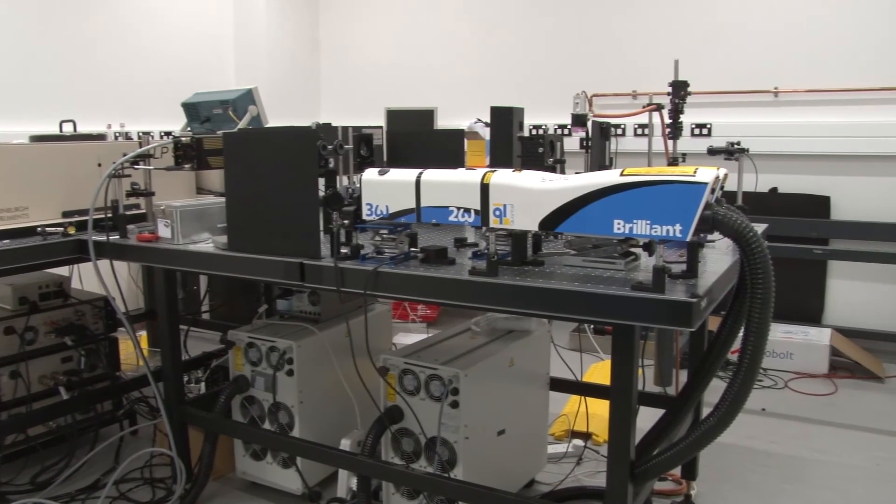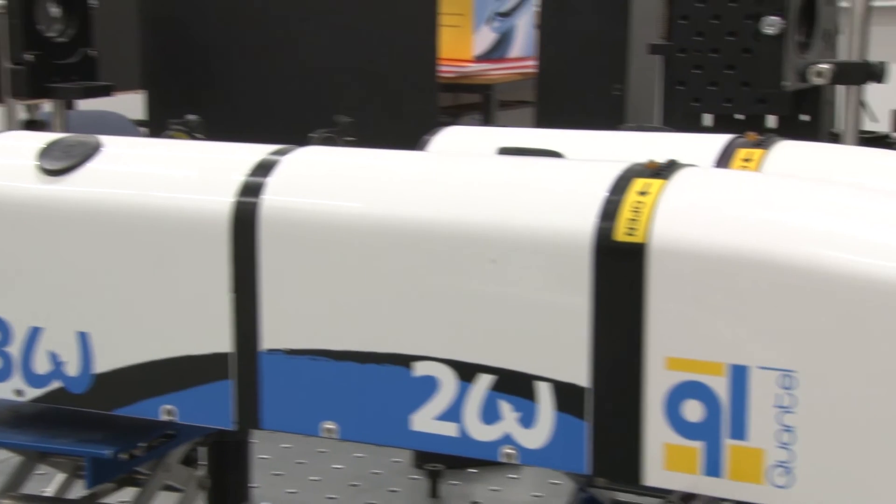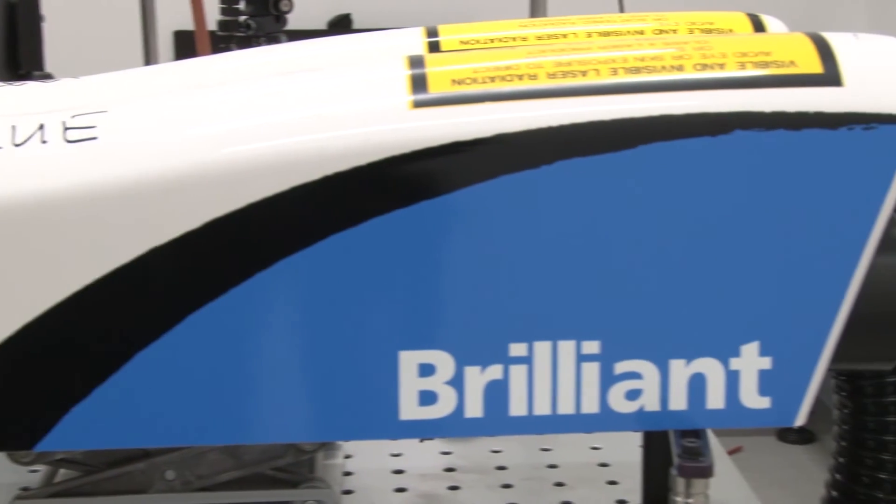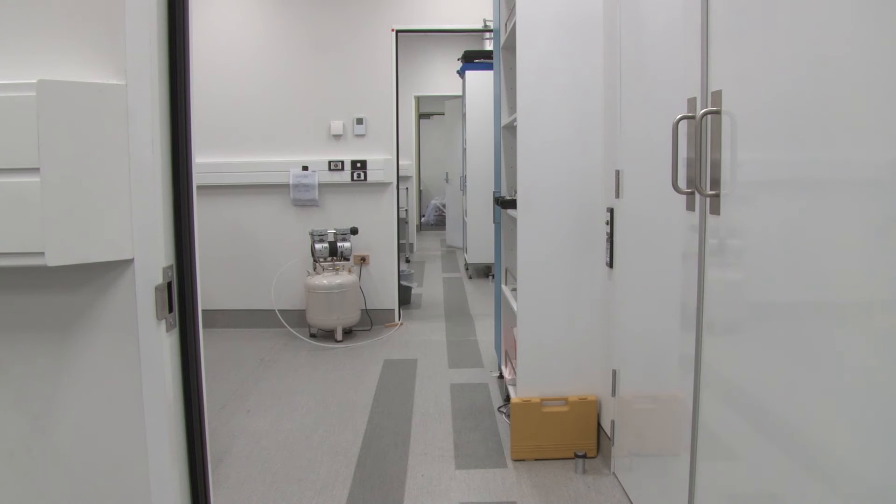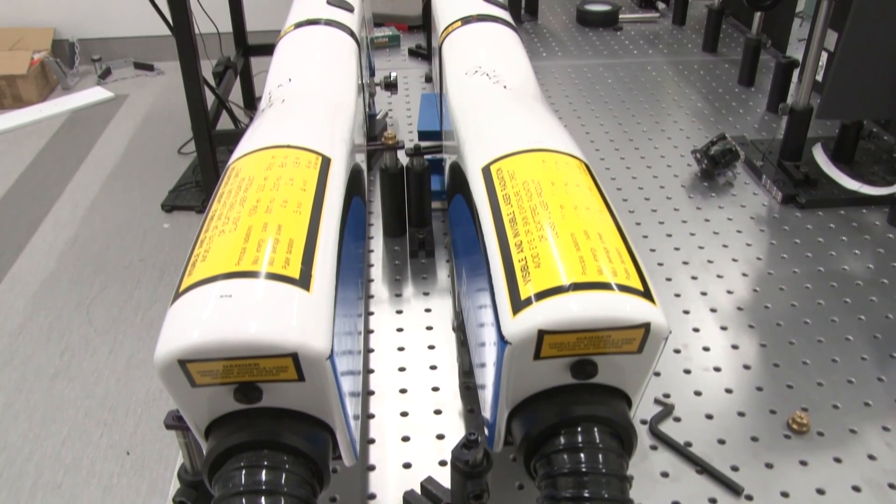One of the big advantages with this facility is the danger levels of the experiments - the hazard gets more and more dangerous the further in here you get. So you can't get in here unless you go through all those doors. What do we use it for? Why make such a dangerous experiment?